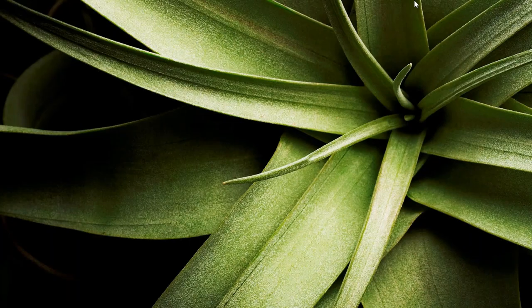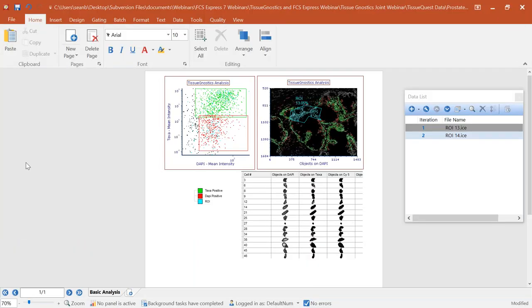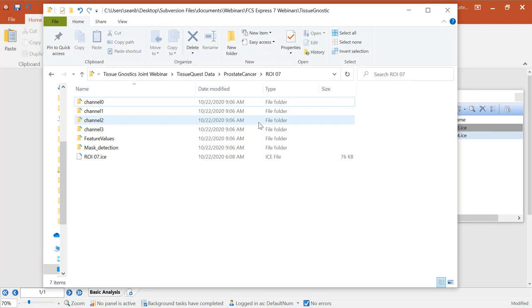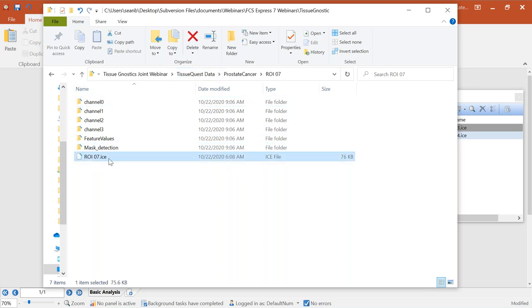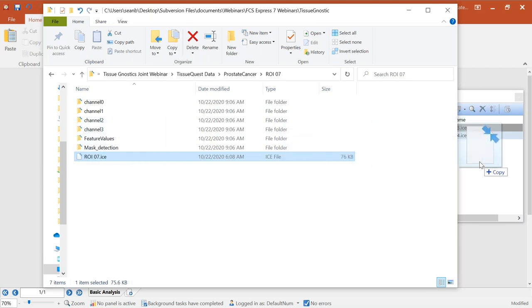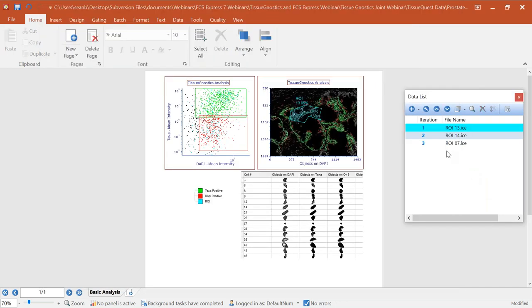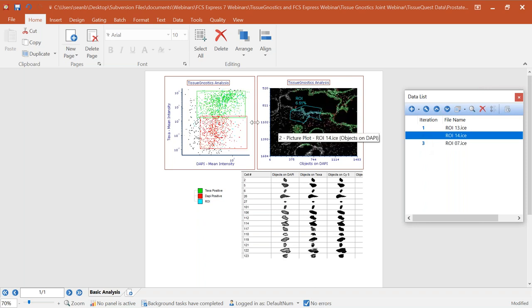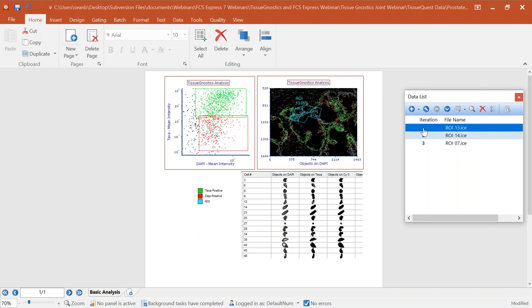So I'm going to open up FCS Express. I've got some data loaded here. When you have data coming off of TissueQuest, StrataQuest, or HistoQuest, a file called a .ICE file is going to be created. When you're ready to work with that in FCS Express, you can simply drag it and drop it into what we call the data list. You can also drag and drop it directly into the analysis area. When you've dragged and dropped it, you can click on this data file — it's going to switch to that file of interest for whatever plots you might have up — and you can get off and running with your analysis.